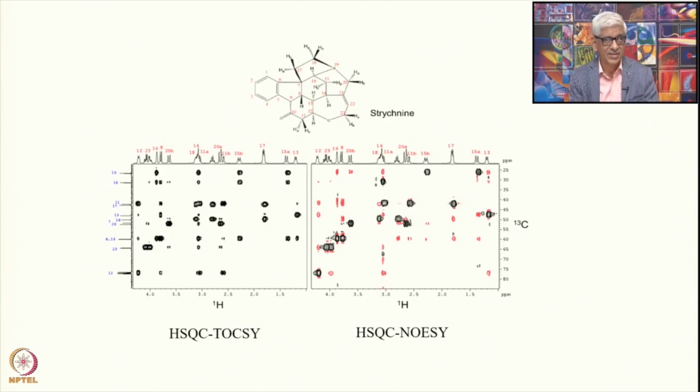Okay. Let us see an example here. So here is an example of a small molecule. This is strychnine, this is some kind of a drug I guess.